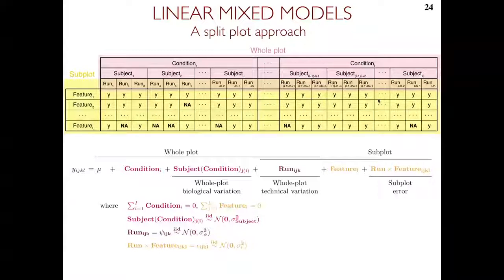And this gave us an inspiration, because these really big models are complicated, they take a long time to work with, and they have convergence problems, they fail in many ways. Figuring out that we could replace solutions to this model with a two-step procedure, where first we do the summary, that is, we take care of the yellow part and get one number per protein per run, and second we look at the pink part, allowed us to become very general in terms of designs and in terms of experiments and handling missing values. So that's what we do.